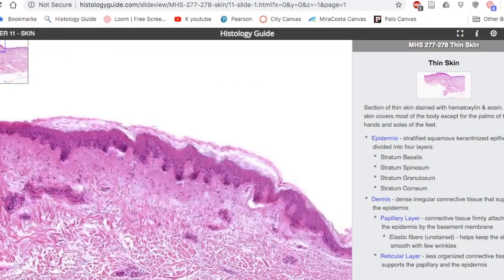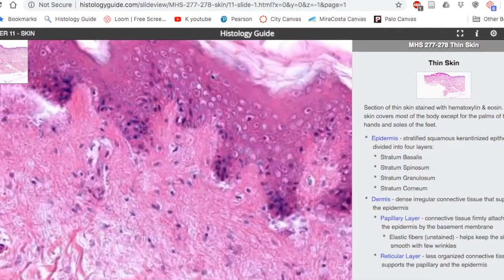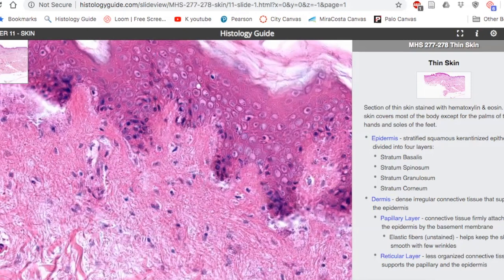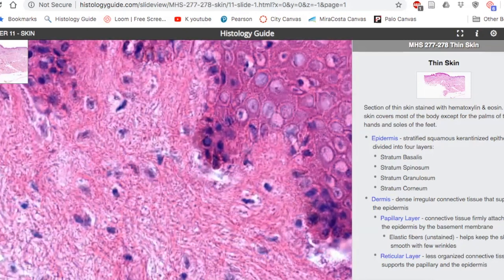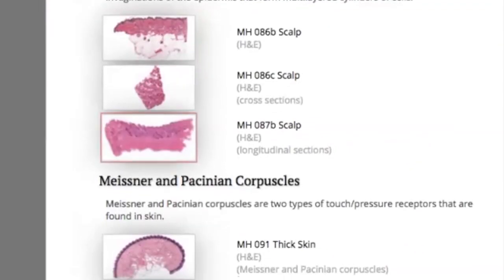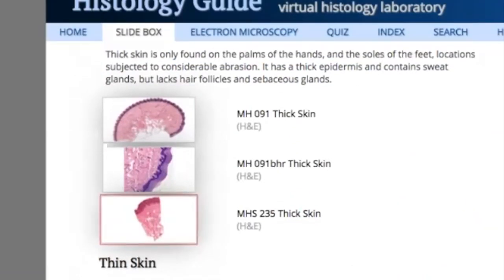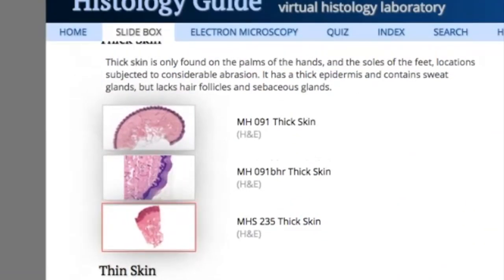And the main protein in these tissues that you could see on any slide is collagen, right? So in loose connective tissue, it's taking like a single strand sort of look, right? So if we look here, trying to find a good example. I think this one's good. This might be one of the other ones I use.